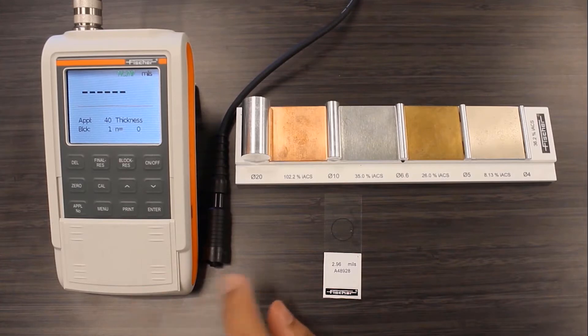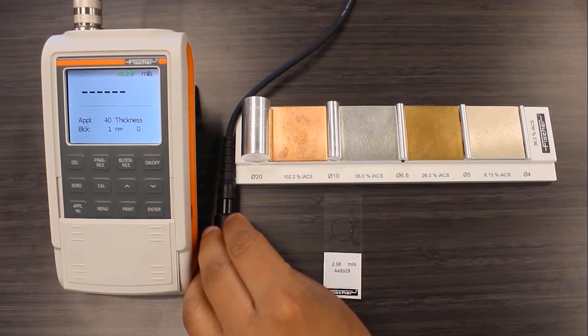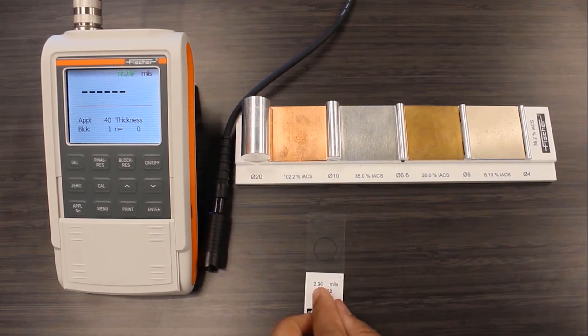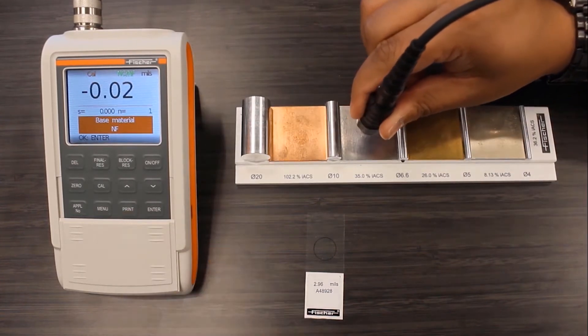I have a dual scope FMP40 with an FTD 3.3 probe to demonstrate its curvature compensation capabilities on this Mylar calibration foil with the help of cylindrical substrates of various diameters. I'll start by calibrating the instrument with a flat substrate.